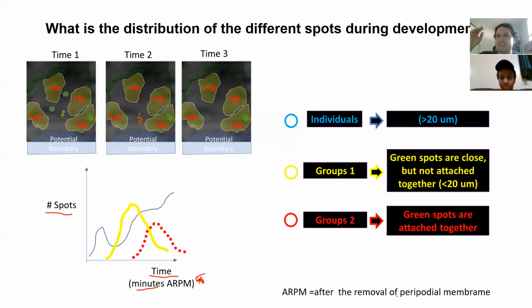Okay. And I didn't send you that movie because it started developing and it started moving the legs too fast. So they are not pretty. And in the beginning, I think it will cause more confusion but later we can go through that. So we can see, for example, if maybe the spots appear more at the end when the tumors are breaking, or maybe they can happen. Every movie could be different.